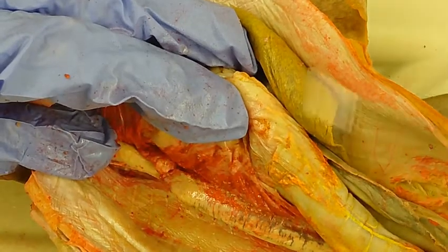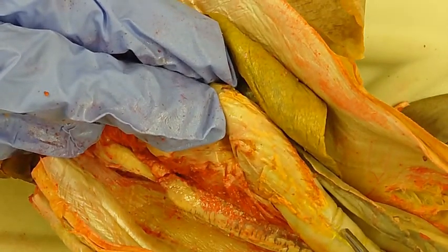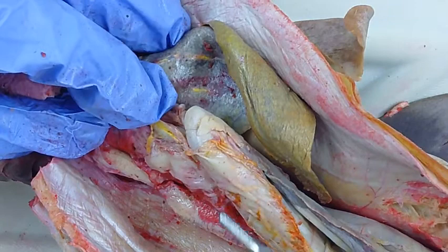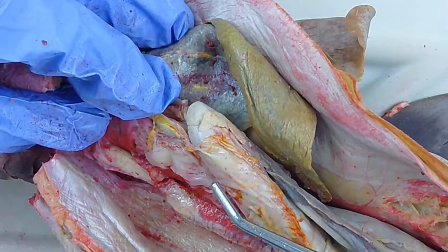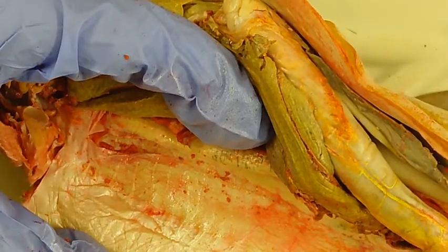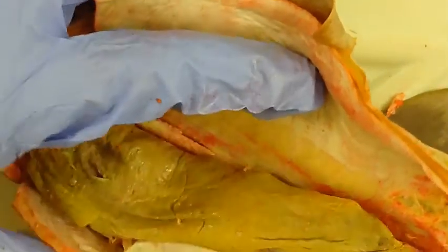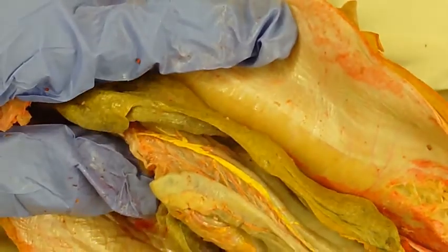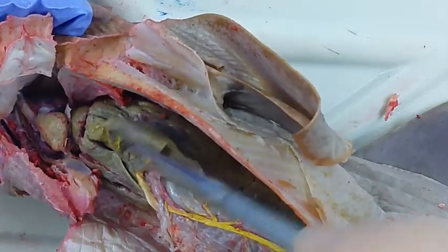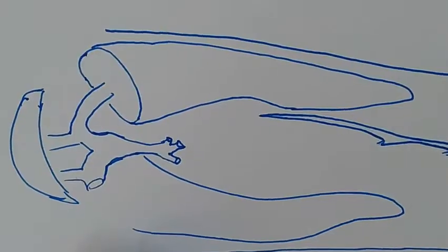And the anterior intestinal vein here drains the right side of the valvular intestine, and the lienomesenteric vein drains the spleen and the stomach. Lateral abdominal veins on either side here receive blood from adjacent trunk areas, and then hepatic arteries up in here course alongside the bile duct and enter the liver. A little bit of a different view here.